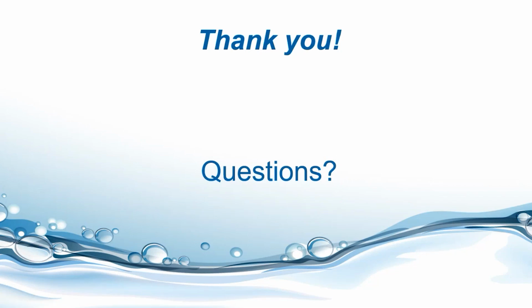Yes, I can only add a couple of words to Casey's response. The arsenite is used as a chlorine scavenger. So in some situations, when you have interference from other compounds in the water, you can determine the value of that interference by killing the chlorine in the water and measuring that sample again. The difference between the measurement without arsenite and with arsenite gives you the value of that interference.